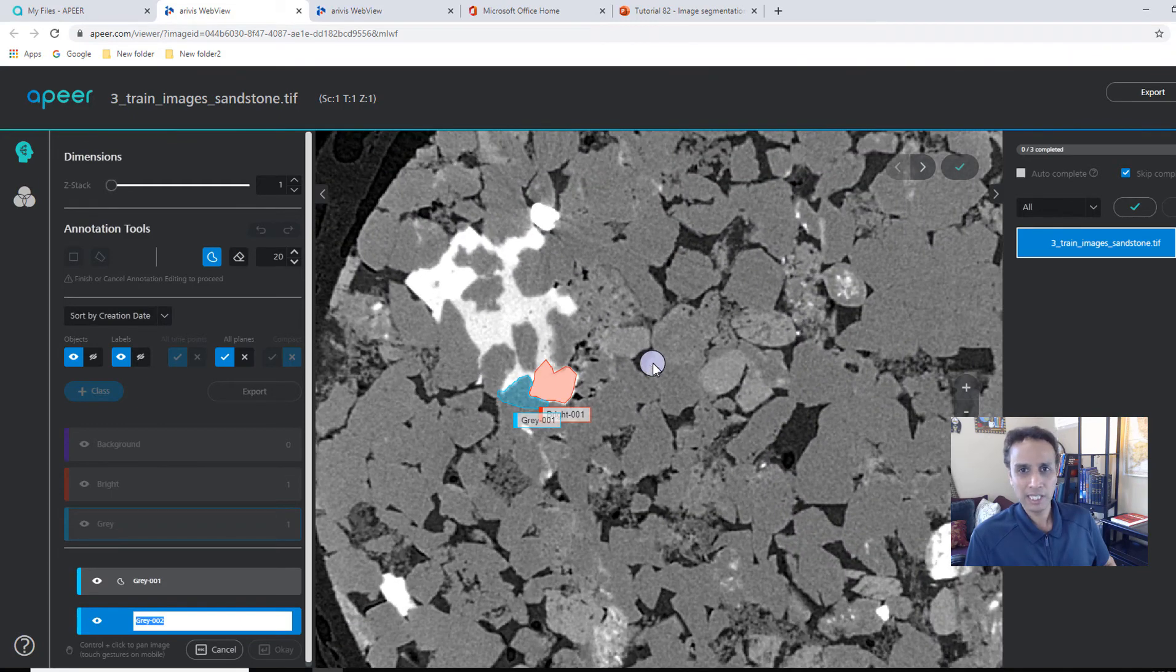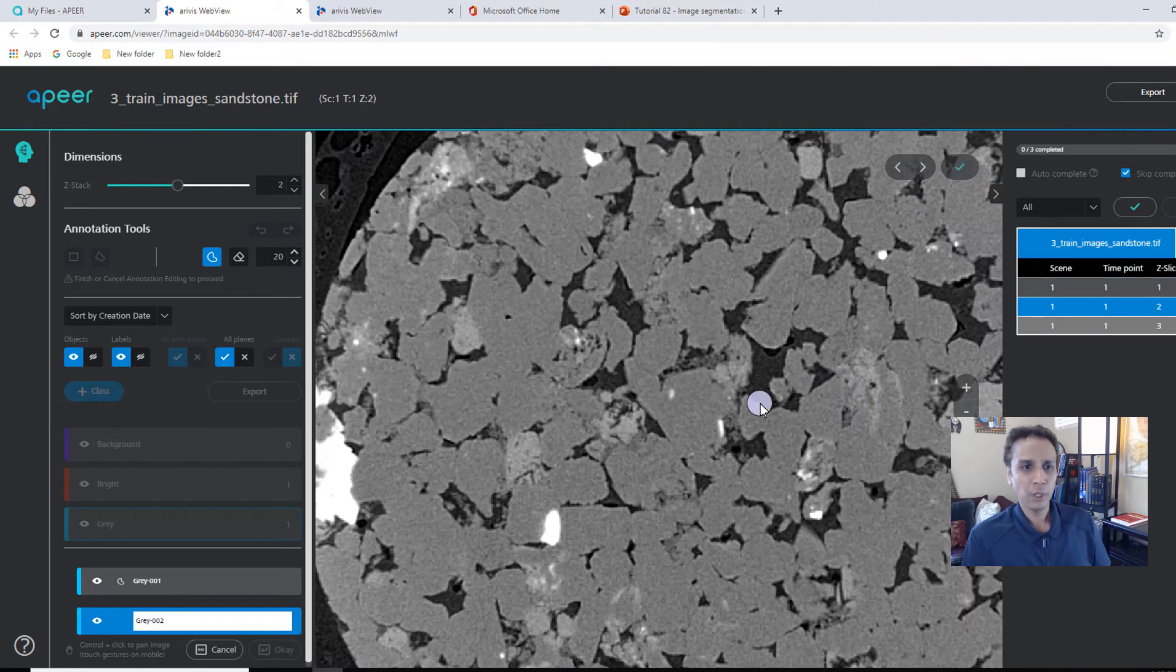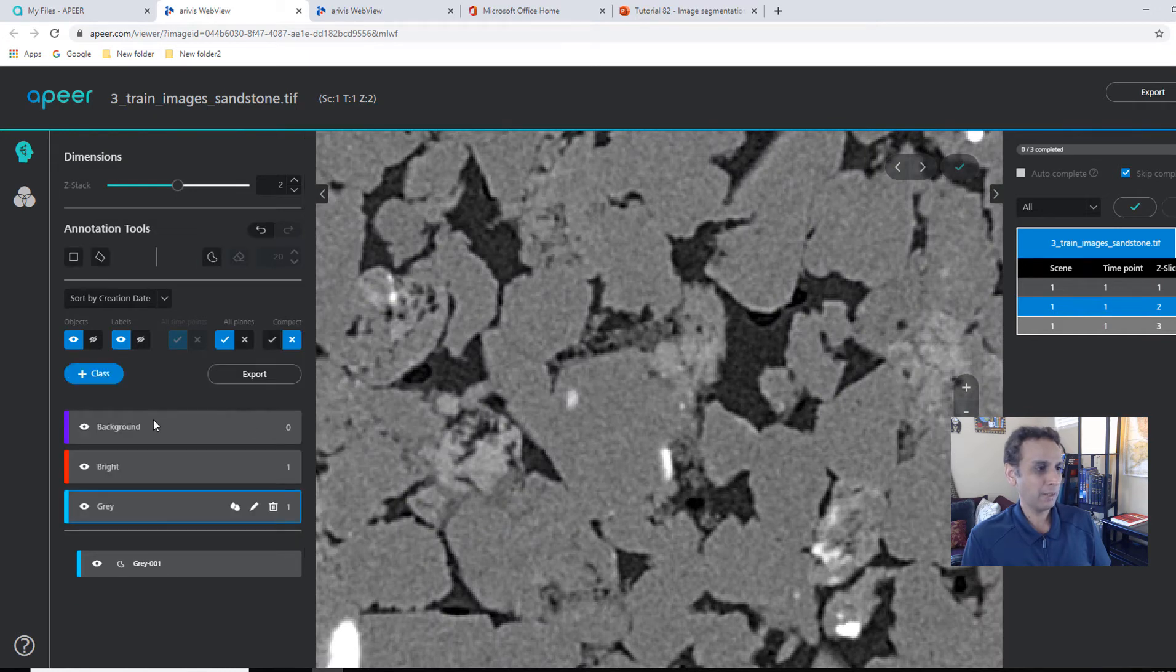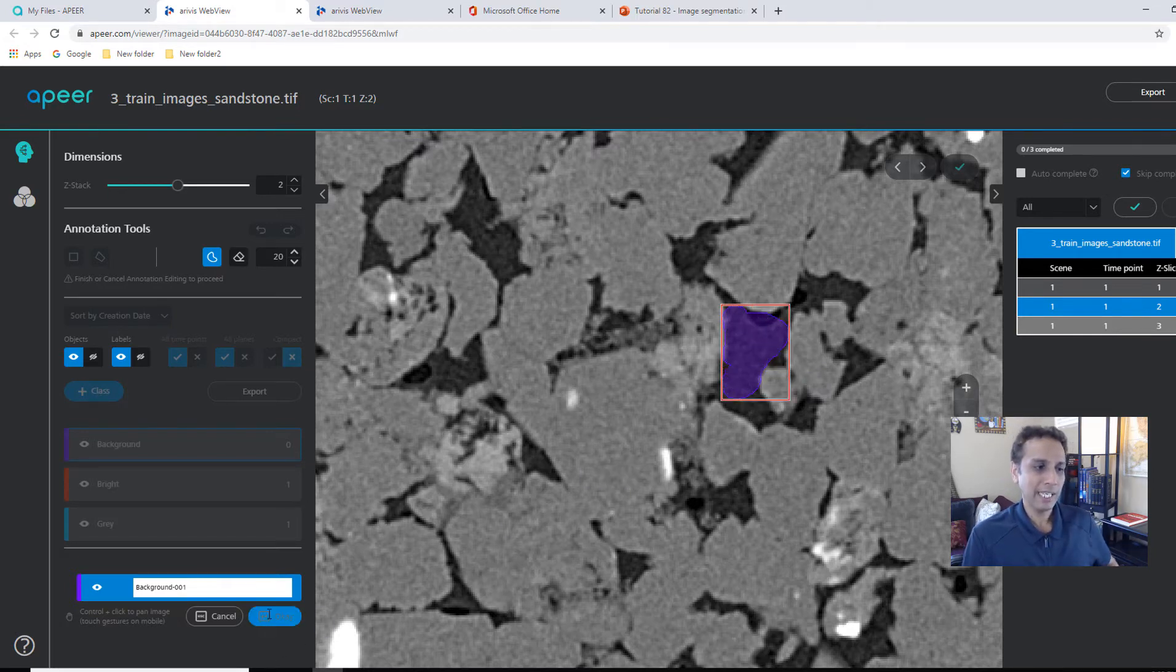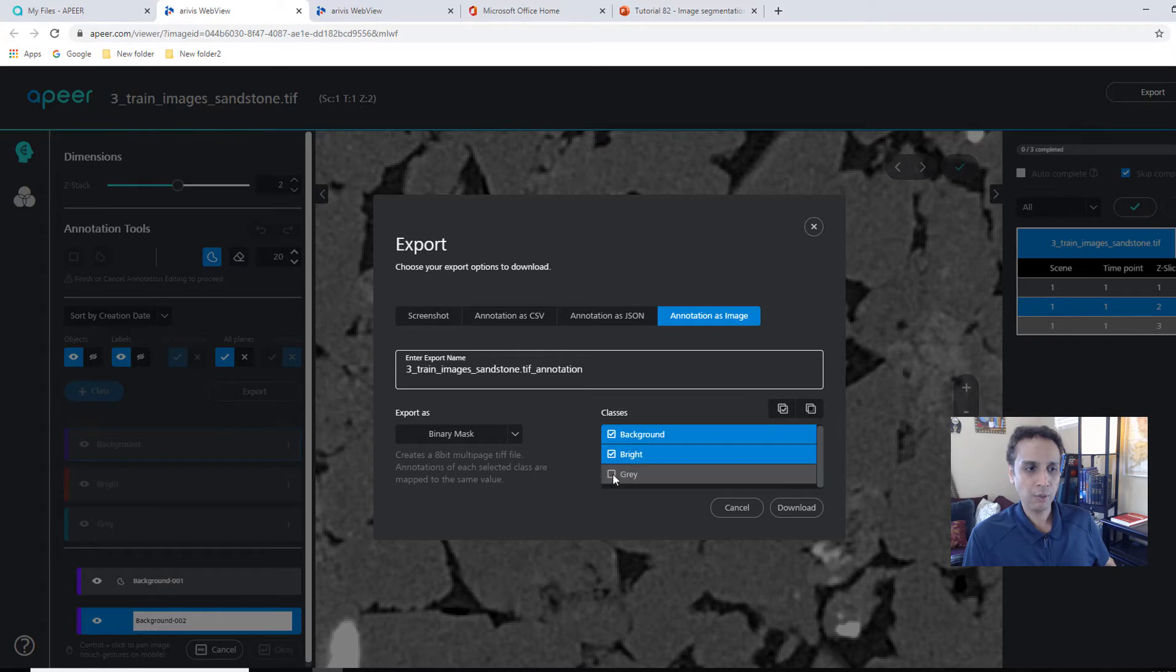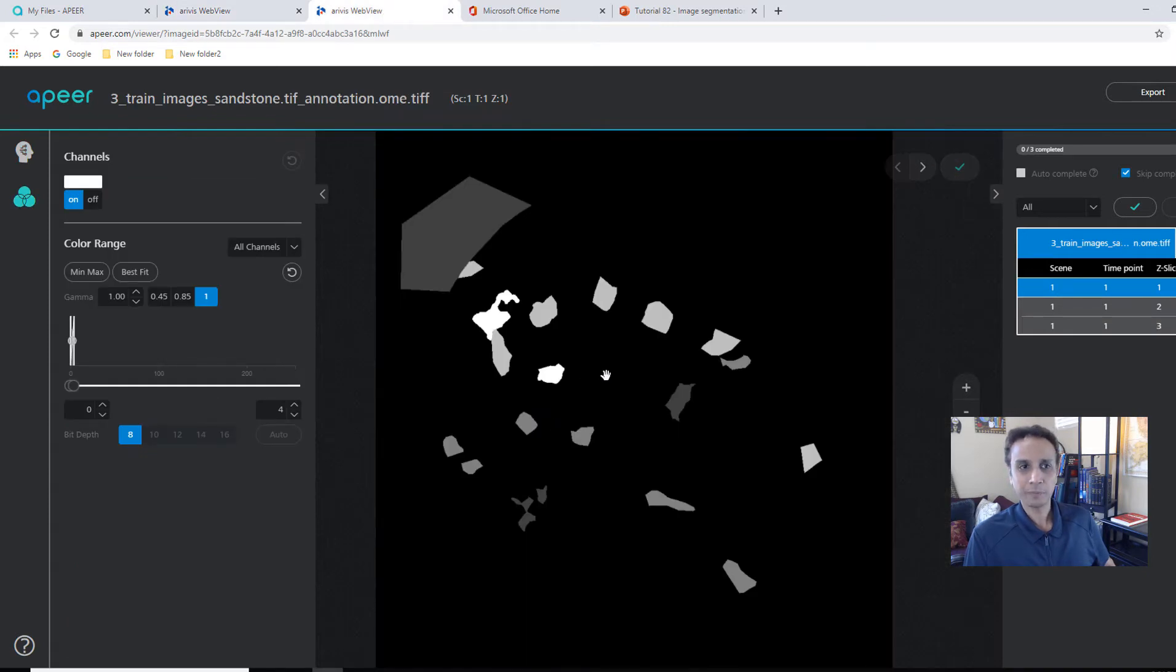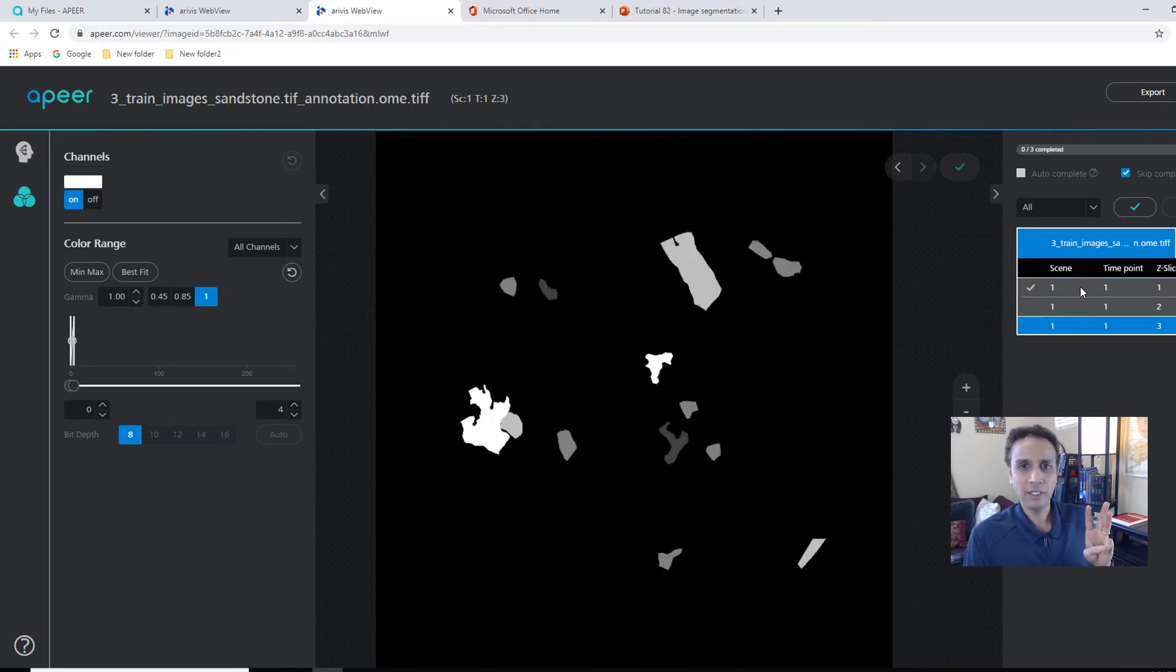The bright pixels are easy to classify. The boundary ones are different. So you got to do this. And if you go ahead and cancel after you're done with a given class. Now let's do gray and I'm going to show you a brush tool. So if I zoom in, you see, this is what I mean by boundary pixels, tell it exactly how you would like to label the boundary pixels. And then when you close it, it closes it all the way. And you can select it multiple ways. And remember, this is an image with a TIFF stack with three images.